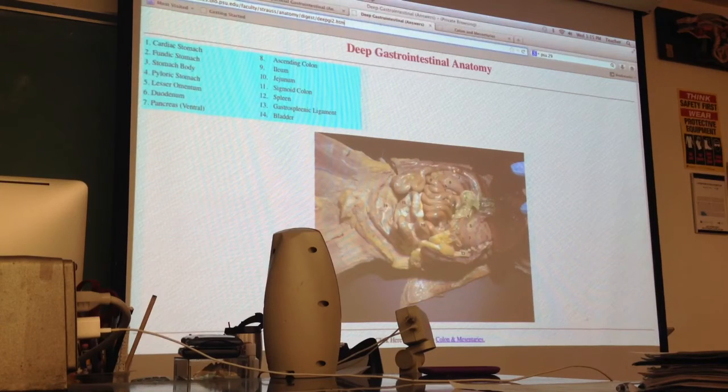Okay, so I'm going to finish my explanation of the small intestine now. Again, the duodenum is going to be in view of the stomach, close to the stomach. If we're asking for the jejunum, we're not going to be showing you whether it's close to the stomach or the large intestine. We're just going to be pinning it just like that. If we want you to identify it as the ileum, we're going to be showing it to you as connected to the large intestine. Now, take a look at the large intestine section.